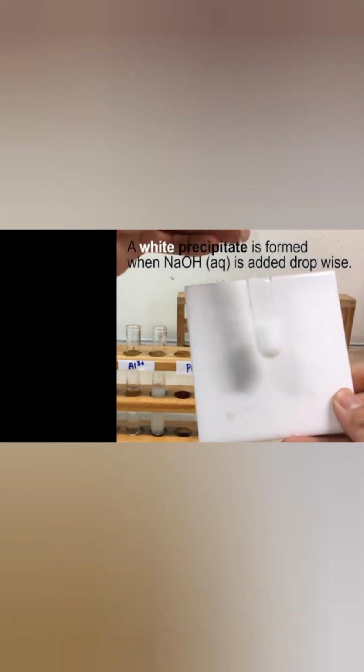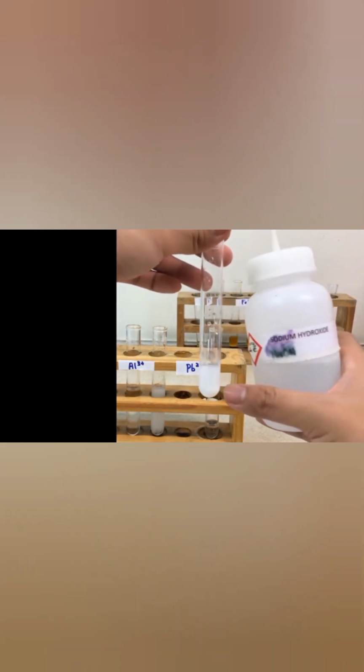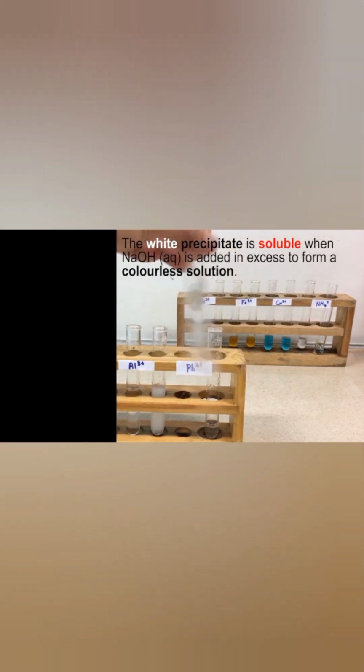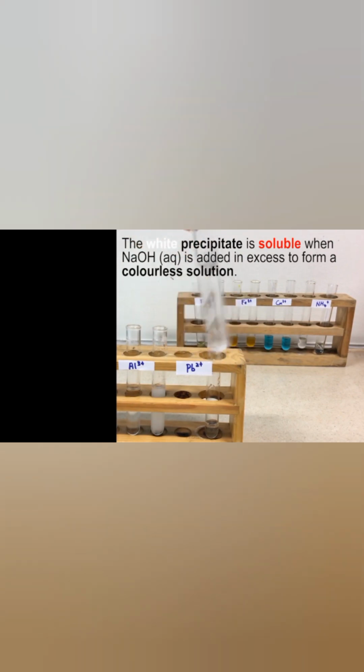Okay, let's go to lead. To a colorless solution that contains lead, add aqueous sodium hydroxide. A white precipitate is formed when sodium hydroxide is added in drop. Now, adding excess sodium hydroxide and stirring continuously, the precipitate dissolves in excess sodium hydroxide. It's no longer there.